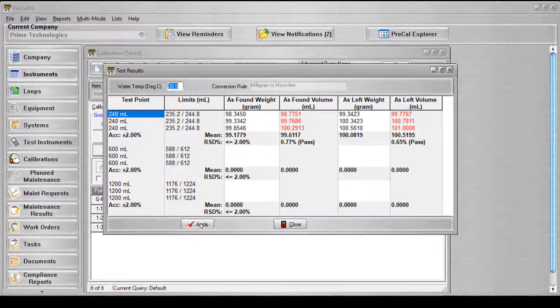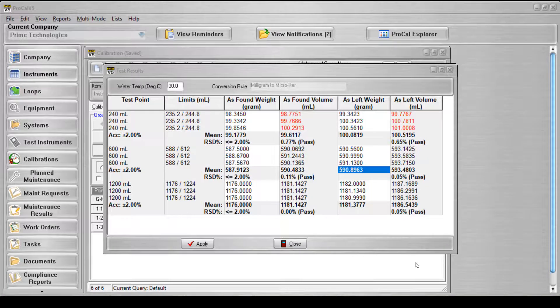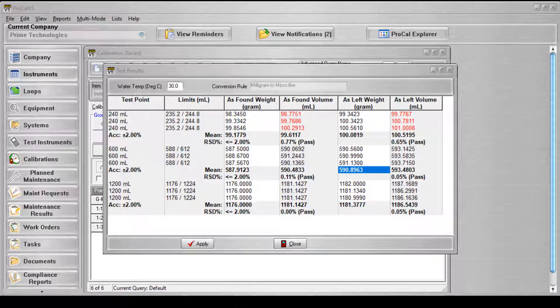For the test point group to pass, the following must be true. Each repeated reading must be within the accuracy percent of the corresponding test volume. For each set of repetitions, the relative standard deviation percent is calculated. This value must be less than or equal to the maximum relative standard deviation percent value entered on the master record. All values must be entered for the test to pass, and the checks are performed on both the as found and as left data. And that's all there is to it — now you can perform pipette calibrations in ProCal V5.